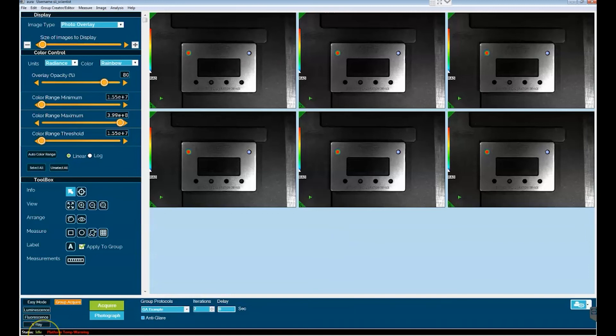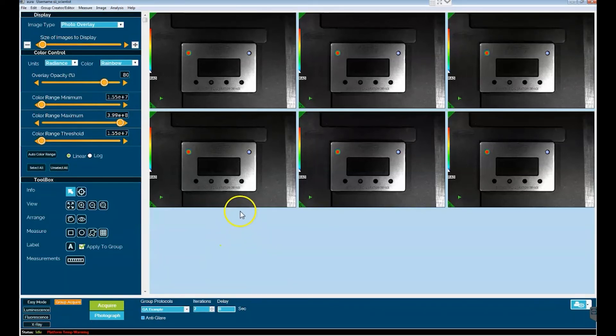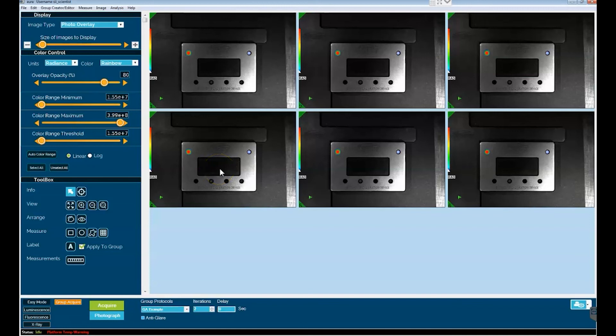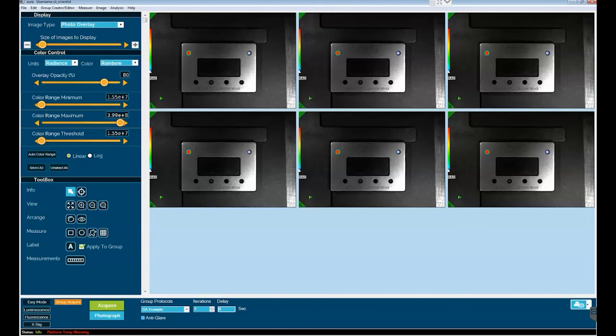Now one of the neat things about group acquire is that it not only facilitates multiple image acquisition, it also facilitates multiple image analysis. Two examples of this are region of interest analysis and image annotation. When one draws an ROI on a single image, it is cross applied across all of the images of the group acquire. And when one annotates a single image in a group acquire, analogous annotations are applied across the entire group. These two analytical features can be demonstrated on this data set.